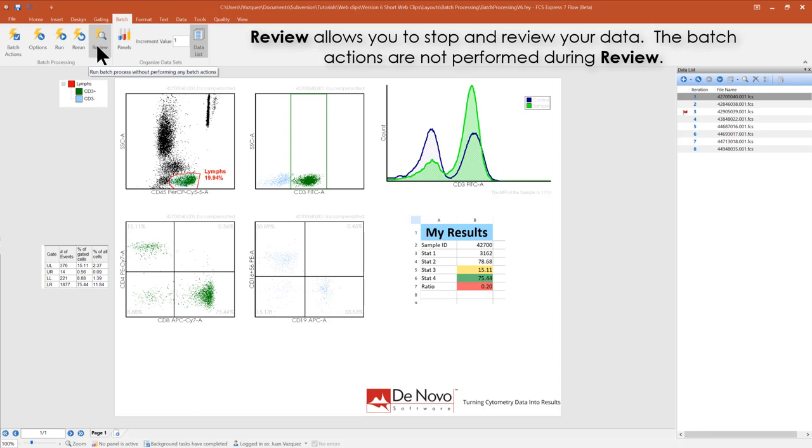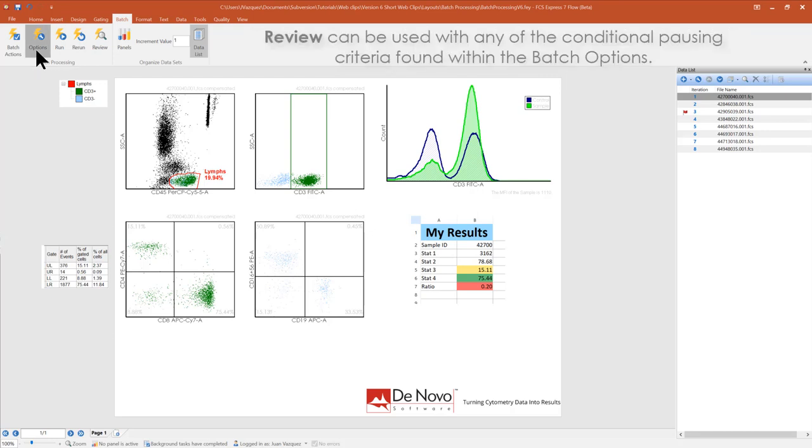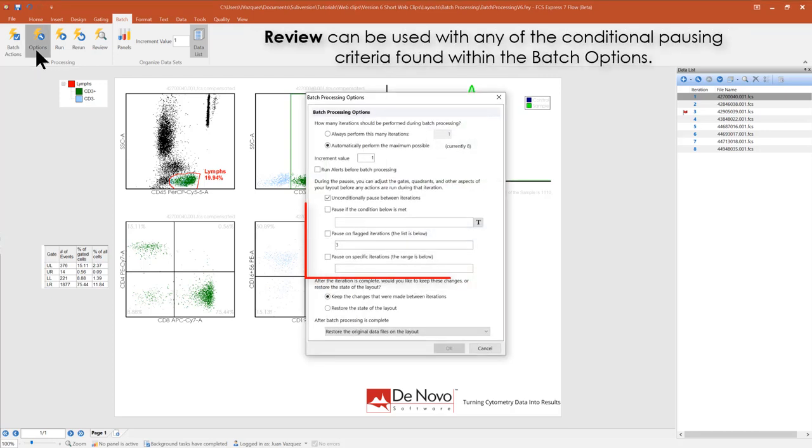View allows you to stop and review your data. The batch actions are not performed during review. View can be used with any of the conditional pausing criteria found within the batch options.